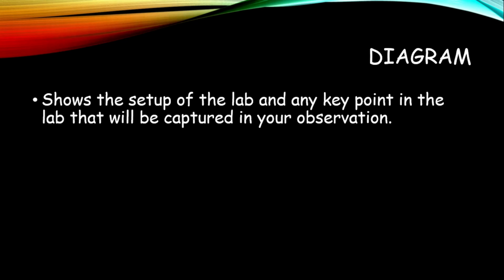And we're going to get there, so you want to follow us with these labs. We're going to be showing you all these labs, and the labs are going to be real labs, so we're not going to edit it so much. We are going to try to see if we even can capture the time of what a lab is really like. You watch it and you get this real feel, I mean, even sometimes you might be hearing some corrections and so on. The real feel of what a lab is like. I'm not going to make it one of those edited virtual lab type of things. We're sort of running away from that. We want you to have a real feel of the lab. So you want to follow us, all right?